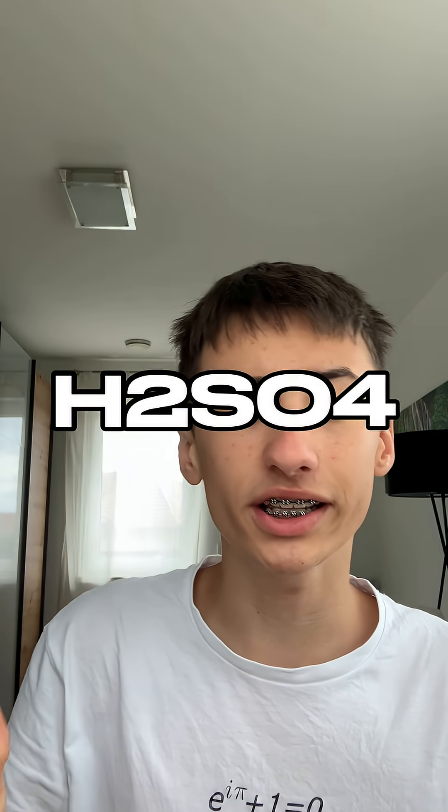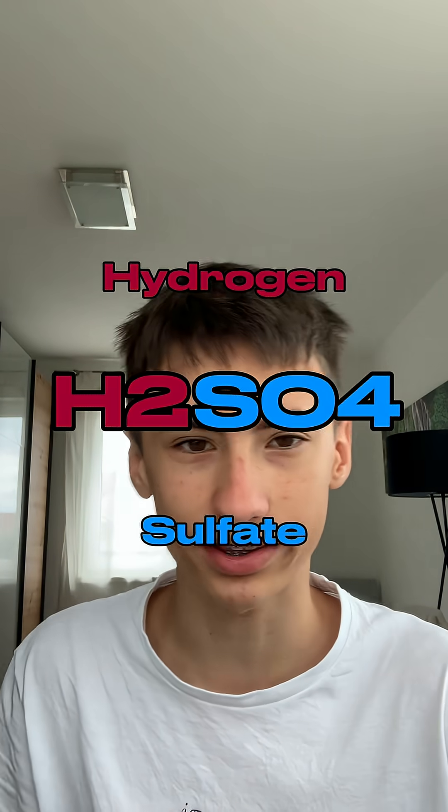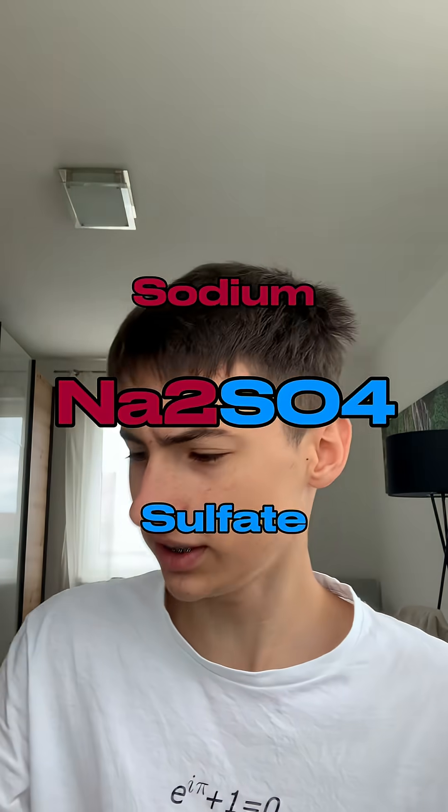The formula of this sulfuric acid is H2SO4. Theoretically you could say it is hydrogen sulfate, but most people don't say that. And this is sodium sulfate — you see the similarity?